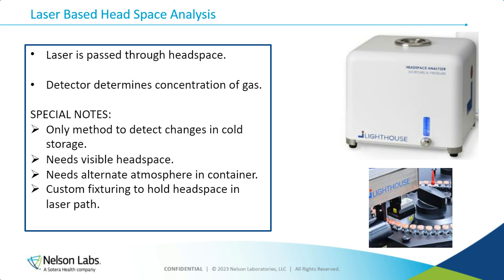The bottom picture here is an example of an in-house manufacturing line. You can see I've got all the vials just going through an area where they're going through the detector emitter, and then past that, there'd be another section in the line that would be able to remove any samples that came with a failing result, so they could be inspected or discarded.